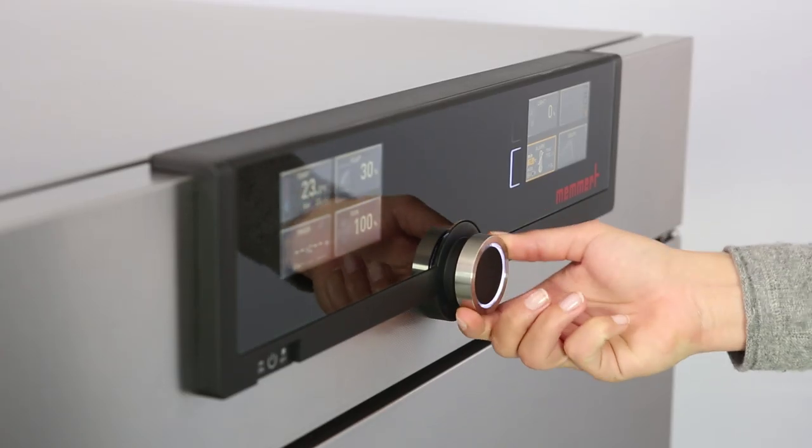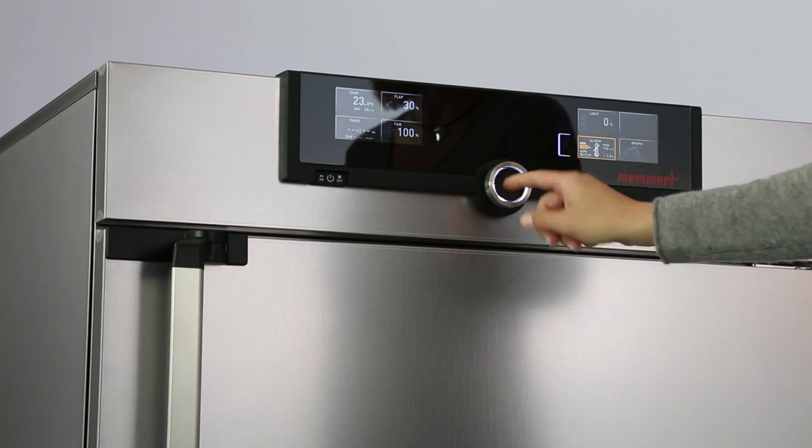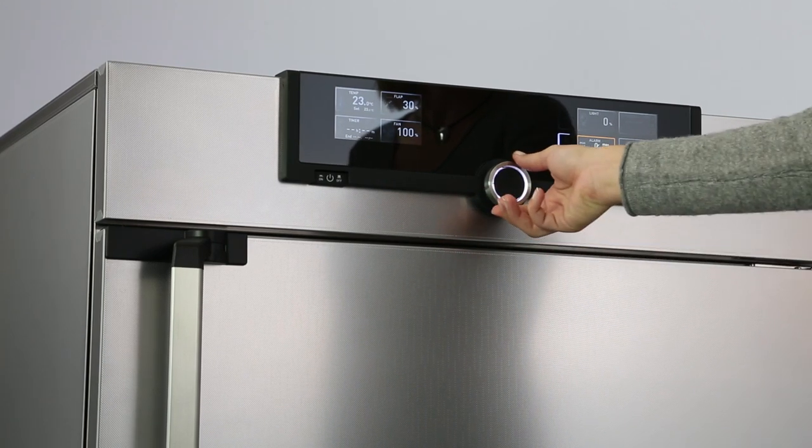In the right display, you can, for example, set temperature monitoring or apply specific parameters such as CO2 and humidity.